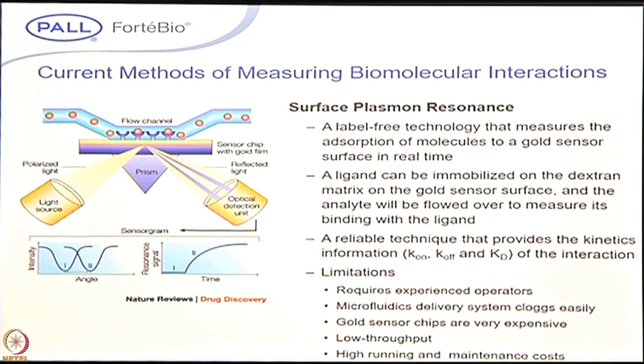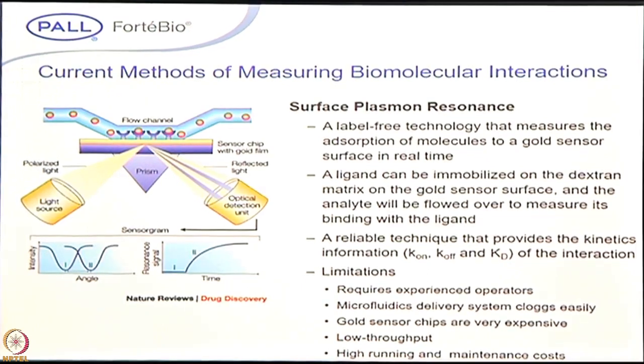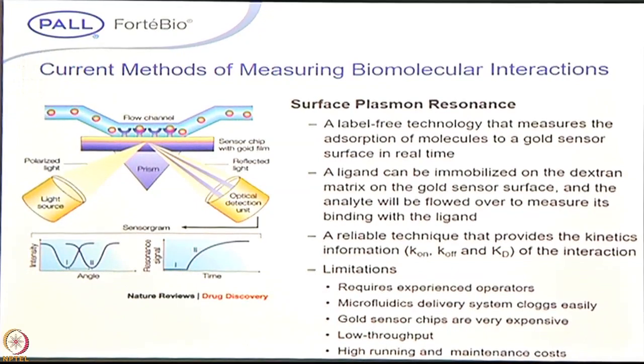When it comes to the limitations of SPR, you require a dedicated operator. Apart from that, the time required for initialization and then getting to the data is tedious. It's almost a day it will take. So when you are doing such an interaction, you require more patience, and getting the data is more time-consuming.